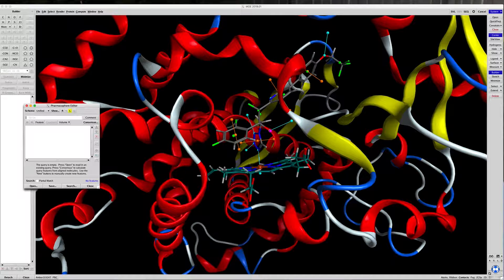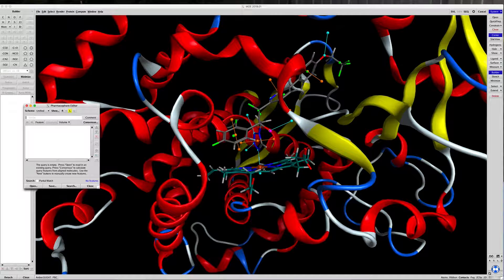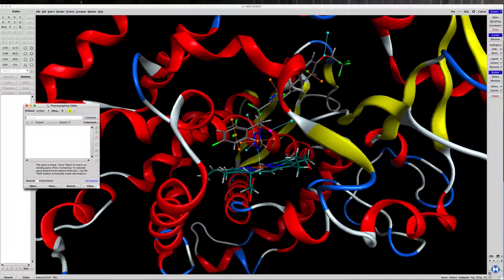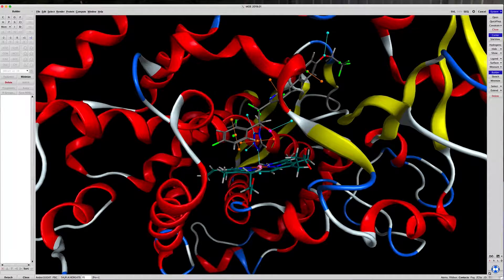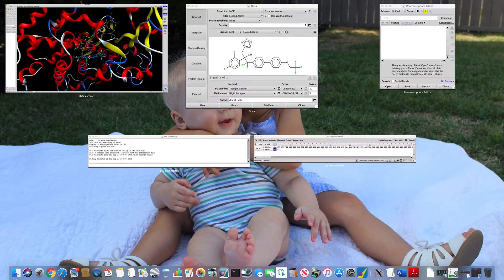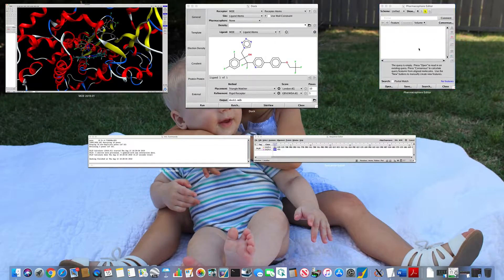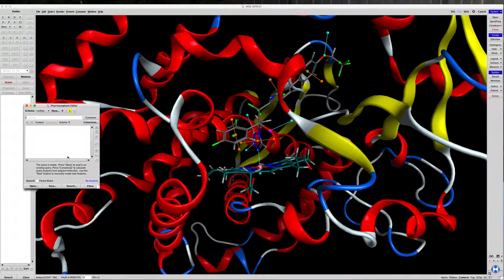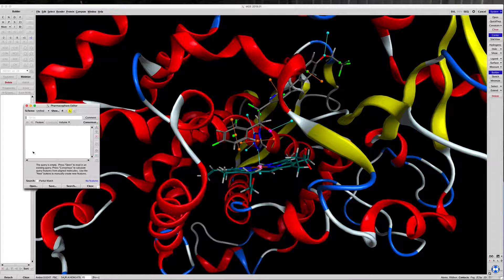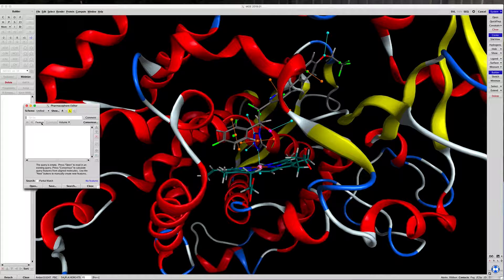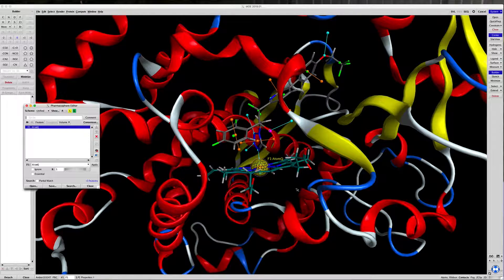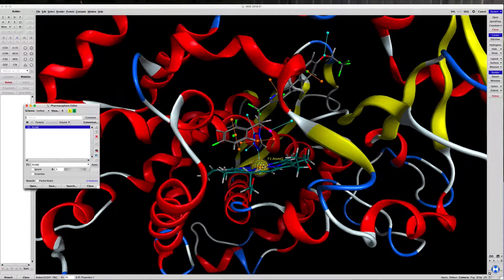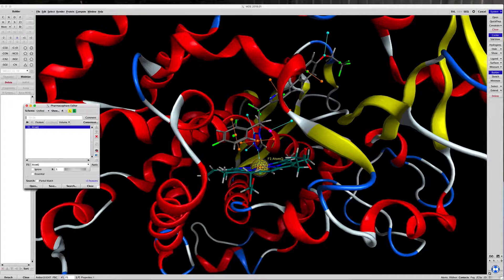So to do that, let's start by clicking on the iron and going back to the pharmacophore window and click on Feature, and that will give you a yellow sphere.